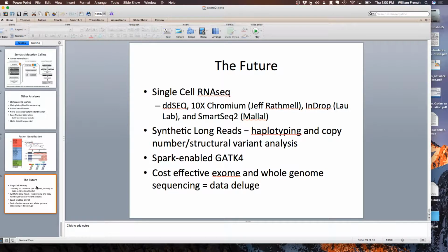You just now mentioned 2 kinds of QC. One is for recalibration, another is for the hard filtering. In order to get good genotype quality, can somebody combine both of them together or just use one kind of method? So whenever you're filtering, you're always drawing a line between sensitivity and specificity, right? So you shouldn't need to do both recalibration and hard filtering. And recalibration is generally preferred if you can get away with it. But sometimes, either for your data set or you don't have enough samples or whatever, you need to hard filter. You mean does somebody combine both of them together? Not usually. Just choose one.